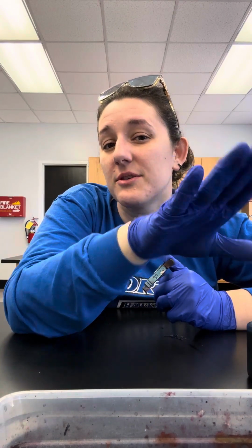So, we will have a bacteria for y'all, like a little thing to choose from. When you choose which one you're gonna do, depending on the bacteria you choose, I don't know if it will already tell you which stain to go do, or if it will tell you to pick which one you're gonna do.